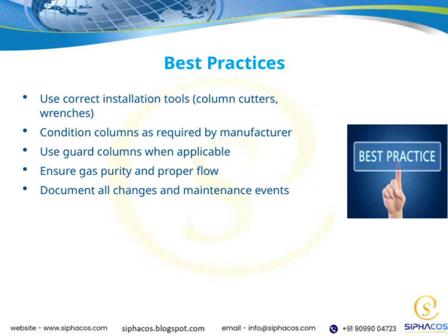Ensuring gas purity and proper flow is another key point. This is vital for the system's efficiency and safety. Any compromise here can lead to issues down the line. Finally, documenting all changes and maintenance events is crucial. Keeping a detailed record helps with troubleshooting, future maintenance, and compliance. These best practices tie back to the overall goal of ensuring a reliable, safe, and efficient system.